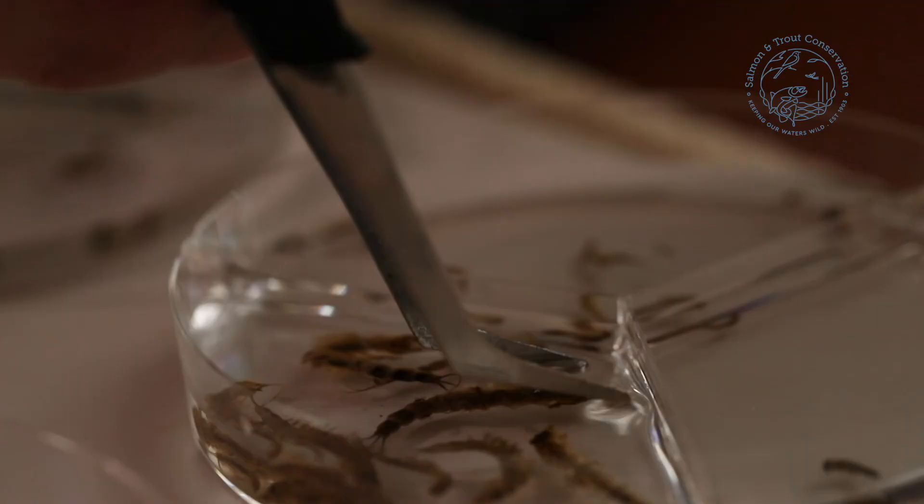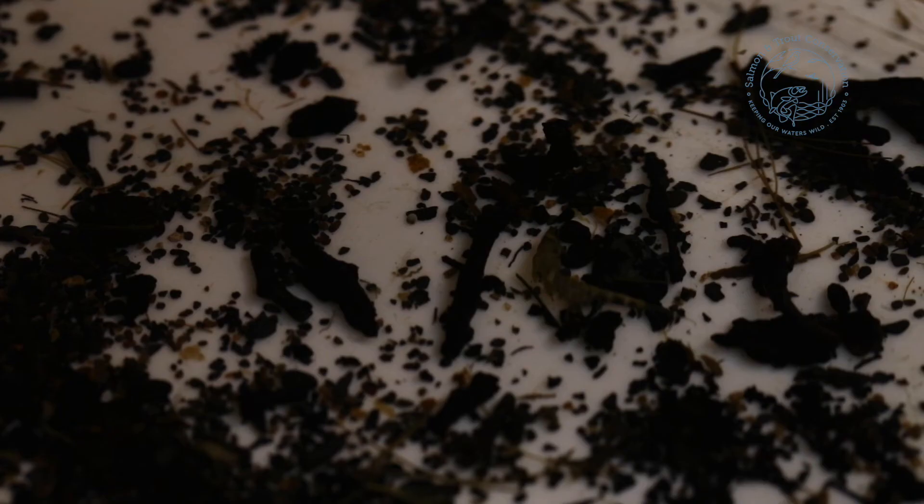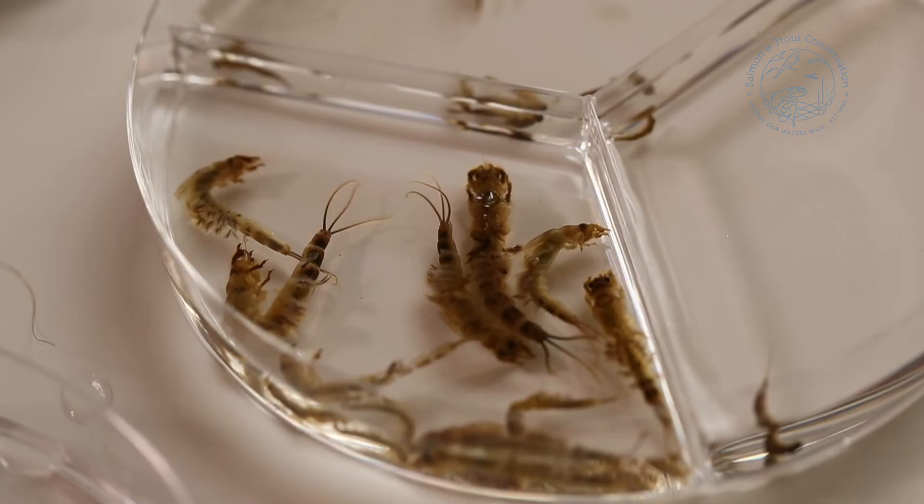What you do need to remember is that anything you've taken out of your sample — all of the extra material — you need to save for quality control purposes. If there is anything you've taken out that you're really not sure about, it is vital that you take a photograph or preserve the sample in a small pot and send it off to somebody who can identify it. Make sure that you are as supported as possible in this process, that what you are doing is accurate. Save everything, use your identification materials and your benchmarking list, and that should get you the best possible result.